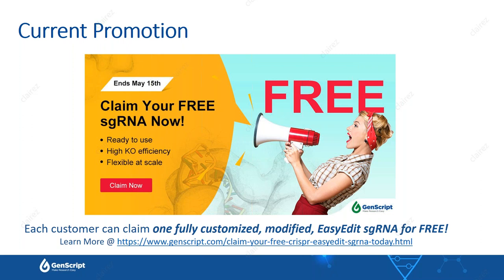Another question. Which Cas9 enzyme can you best use with the Easy Edit sgRNA? We have the Cas9 available. We have one with an EGFP or one without an EGFP. Either one should be perfectly fine for your use case.